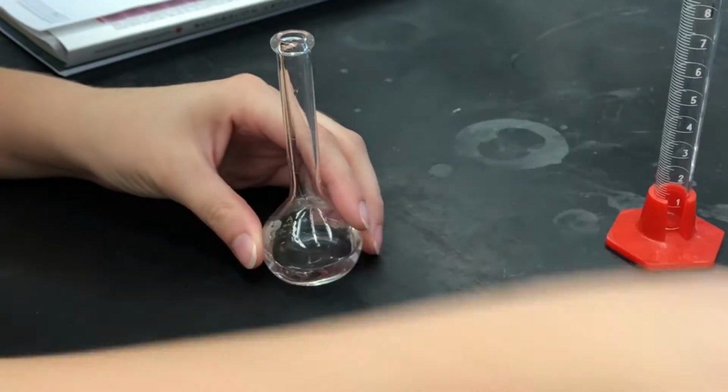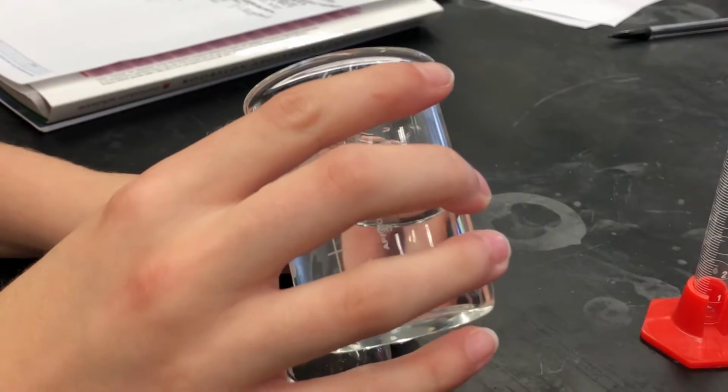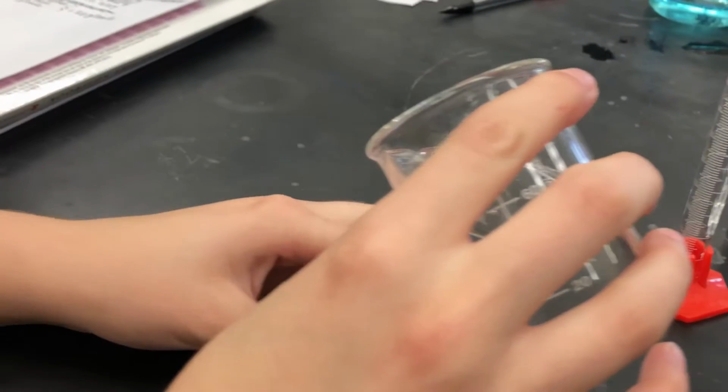This allowed us to subtract the volume of 20% sugar stock solution from the 25 milliliter volume to 1 degree of uncertainty, giving us the volume of the unknown stock solution used.